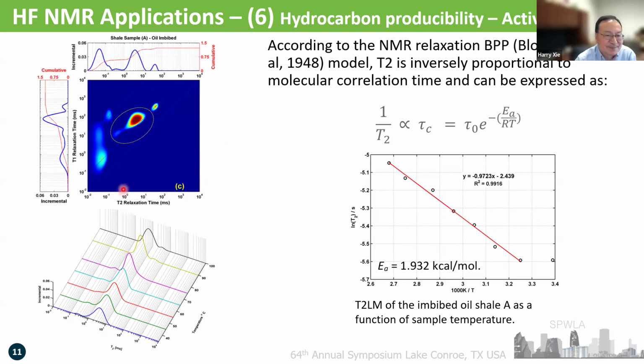Last question. Do you think the high frequency NMR is going to replace the standard frequency NMR? Is there any limitation that you would want to point out, or do you think that in the future high frequency NMR is just going to replace all of this? No, I don't think so.